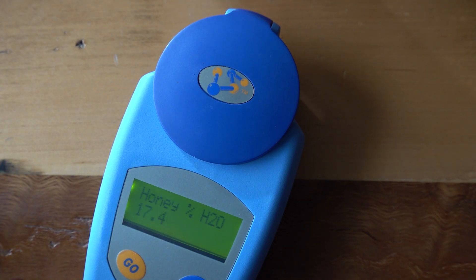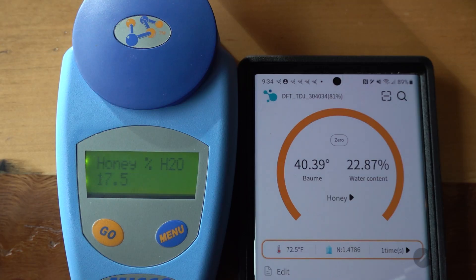The MISCO reads 17.4% water content. That's excellent — that honey will have a nice long shelf life and will not ferment. So we've got a problem: 17.5% on the left versus 22.87% on the FJ Dynamics unit.